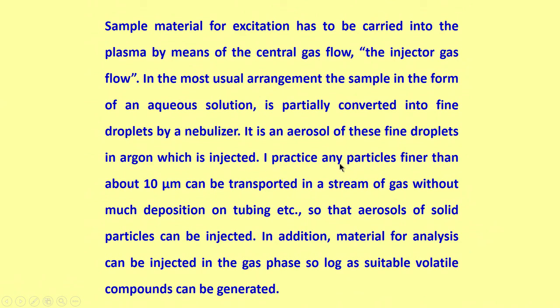In practice, any particles finer than about 10 micrometers can be transported in a stream of gas without much deposition on tubing. Basically, the particles of less than 10 micrometers should be carried into the plasma, otherwise the plasma will extinguish. So, aerosols of solid particles we can introduce if the particle size is less than 10 micrometers.